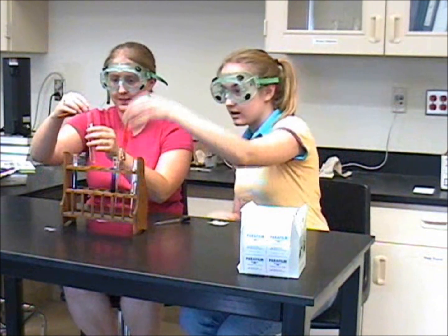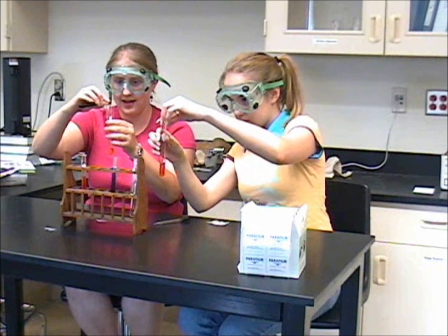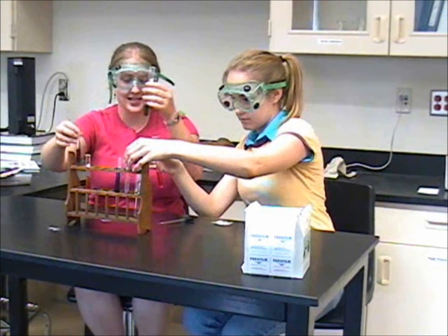So, Crystal, how do you prepare an acid-base solution? Well, it's simple. You just take your acid and your base and mix them in your test tube.